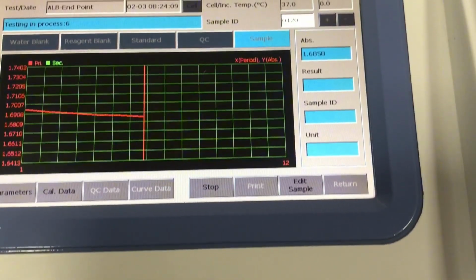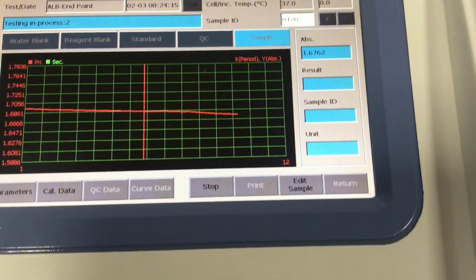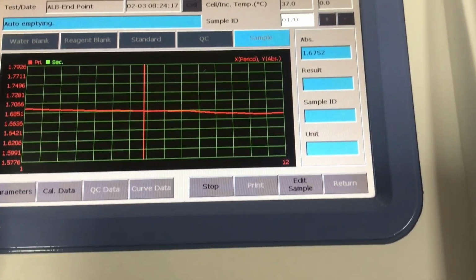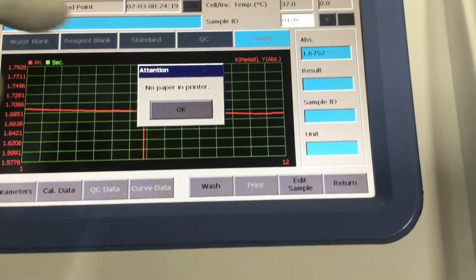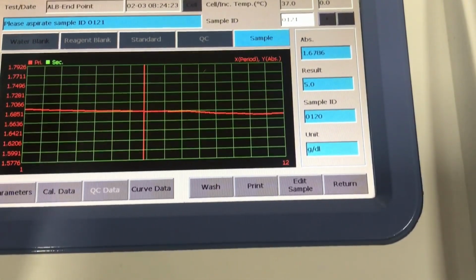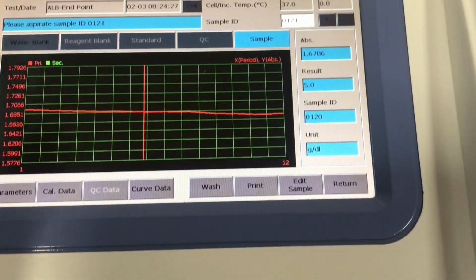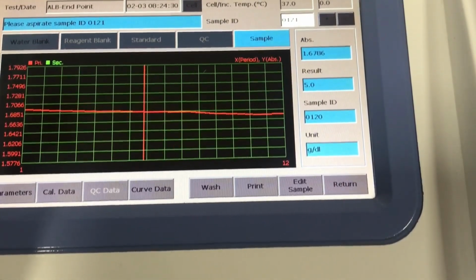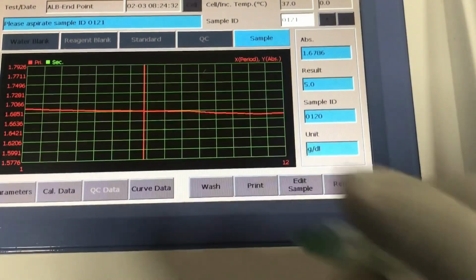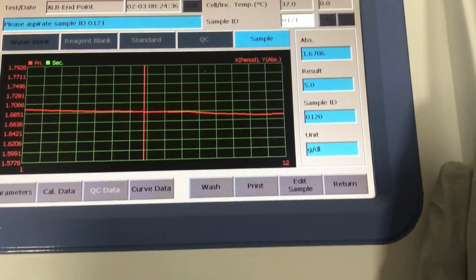Let's see our second value. Our graph is quite okay. That went up to 5.0. That's the second. You see that the difference between the two is quite huge. Okay, I'm going to measure it for a third time without washing, and I'm emphasizing that to show you something.